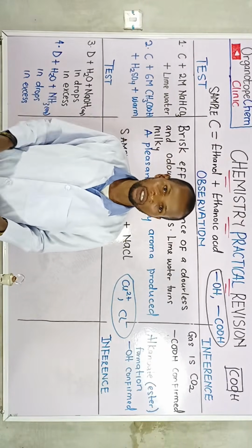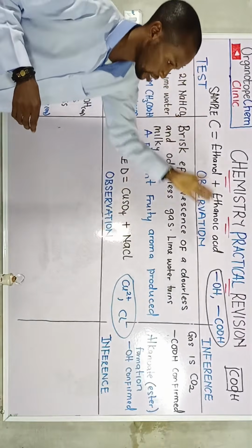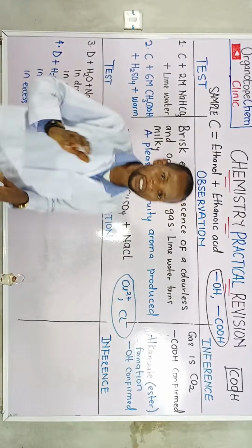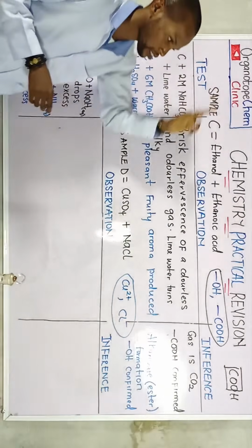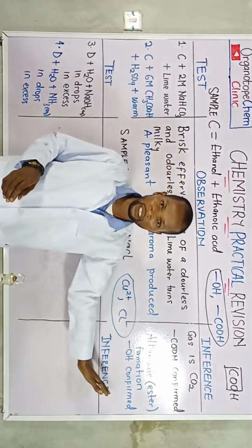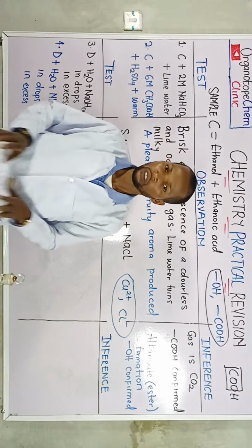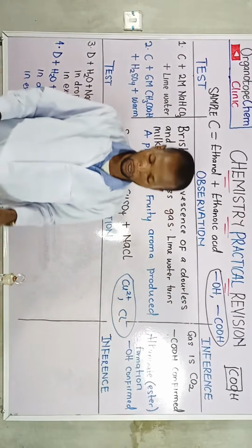Record your tests, observation, inference. The normal laboratory format for qualitative analysis is test, observation, inference. Okay? There is no other format that is acceptable. Test, observation, inference. Okay?